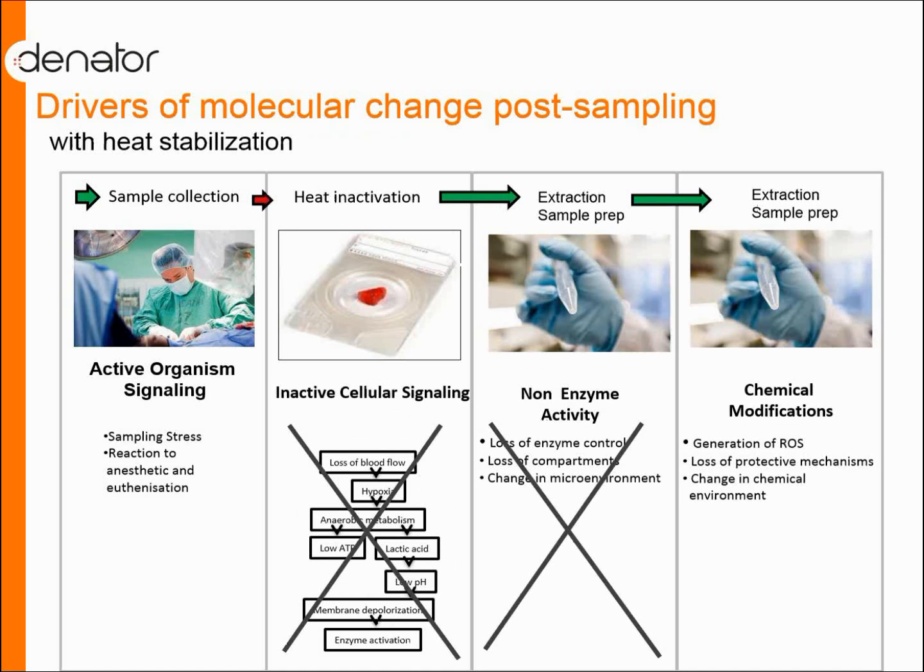We're looking at 2 of the stages here, with the stabilizer system, and we want to remove the enzymatic processes that happen either in the first stage, from the sampling to freezing, or during homogenization, which happens during and after homogenization and extraction, which happens in the 3rd phase.